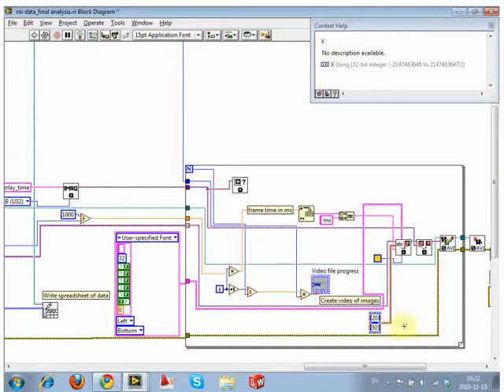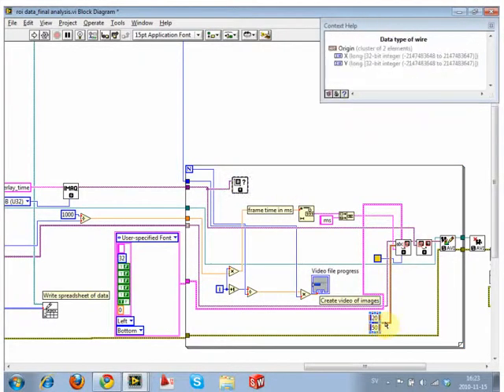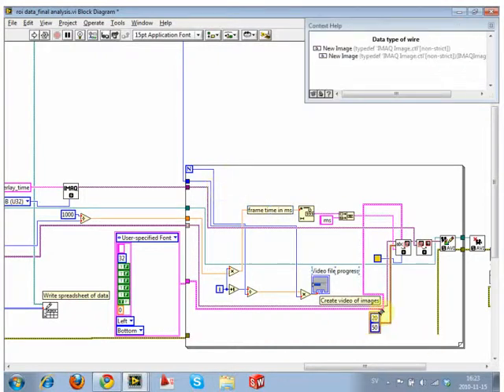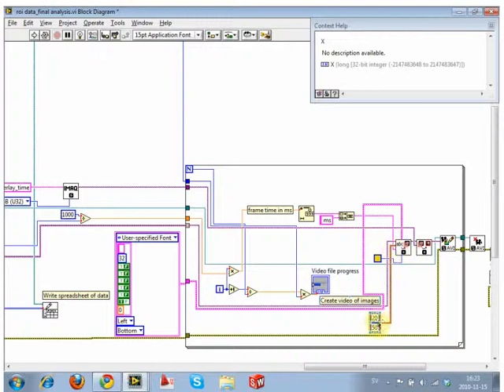So you could be like, look, if you're 640 by 480, you know what ratio this origin should be, and you can scale it for the different images, but more often than not, it's easier just to make a constant. Just tell it where it's going to draw it. And for this image size, I chose 20 by 50. It's an arbitrary number. It doesn't matter. You can put it wherever you want to put it. I shouldn't state that. Sometimes I allow it to modify itself. Most of the times I will allow it.